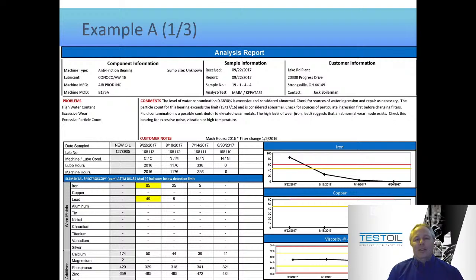And one of the key things that people bring up when they look at this particular result is they say, well, this is all well and good. I appreciate your discussion. I said, but I would never leave that oil in service for another month. They go, it's too far gone, right? And that's a great point. I love it when people bring up that point, and I always tell them, you just fell into a trap. And they go, well, what do you mean? I said, well, here's my point.